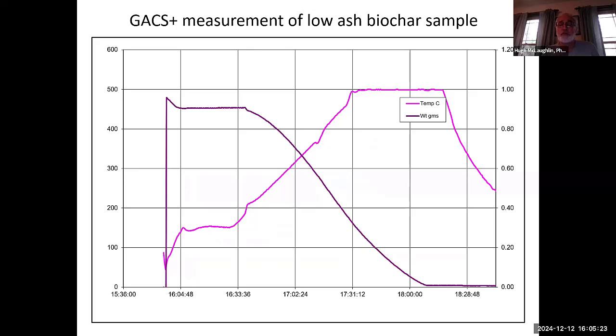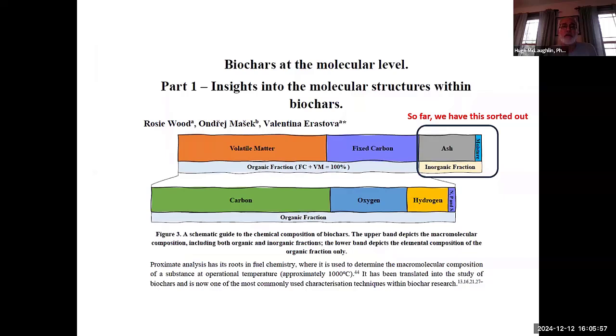And this is an example of a material that's a very low ash, ended up being calculated to be about 1%, which is artificially low for most biomass-based biochars, because the starting material had 0.5% ash in it, and you concentrated it up as you carbonized it, typically to something in the plus 2% range. But these things are possible, and it's a very good insight, and this would be an astonishingly clean char. So don't look a gift horse in the mouth.